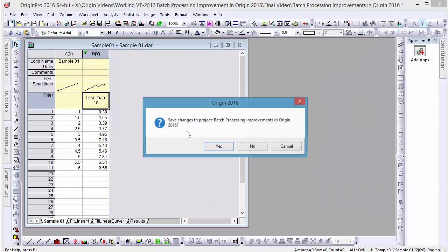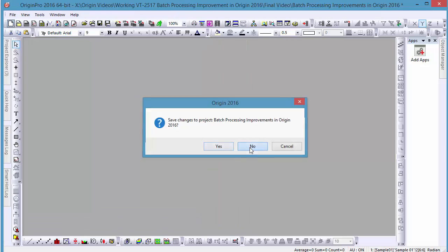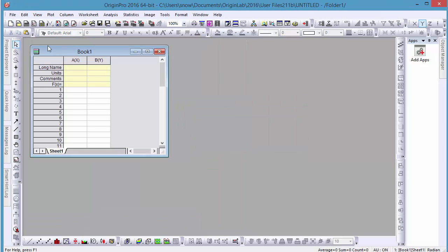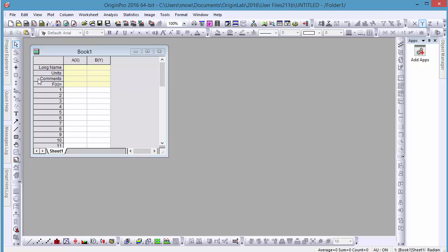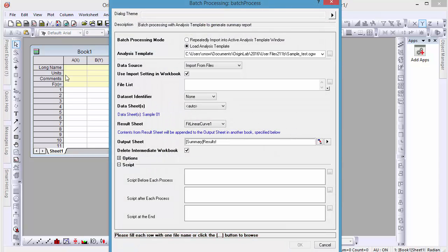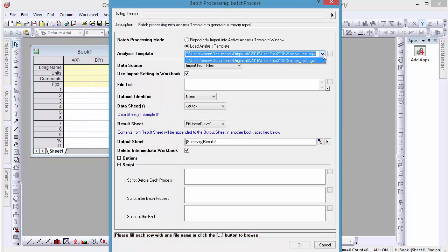To implement our analysis template, go to File and Batch Processing. In the Batch Processing dialog box, let's make sure we have our analysis template selected.